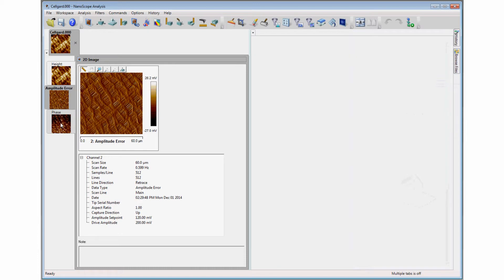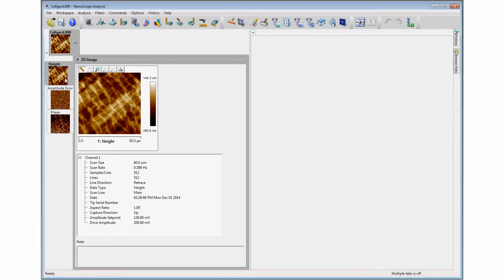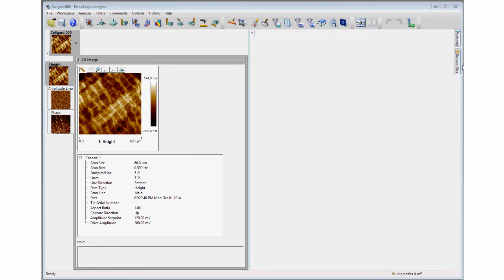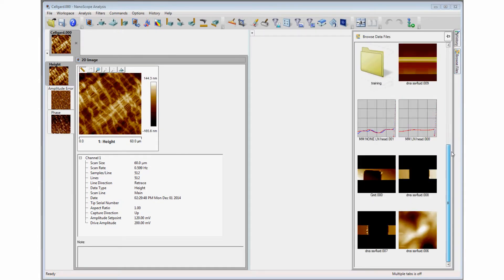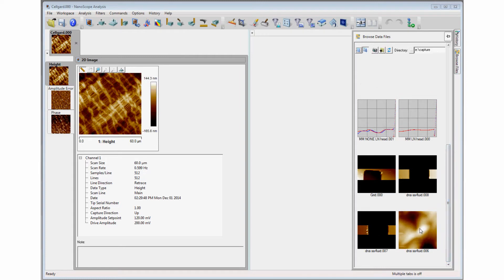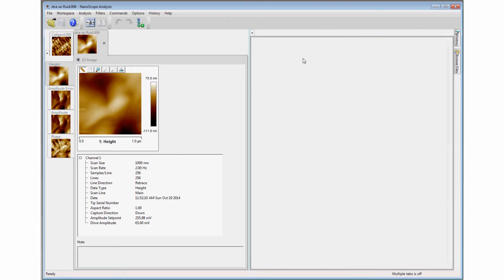Each Nanoscope file can contain multiple data formats. Additional files can be opened in the same pane or in the second pane for side-by-side comparison.